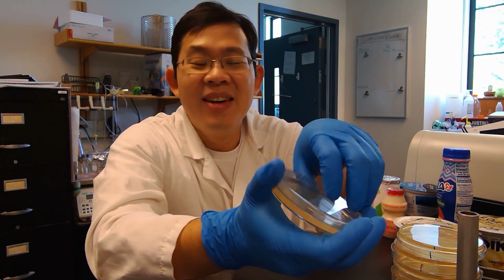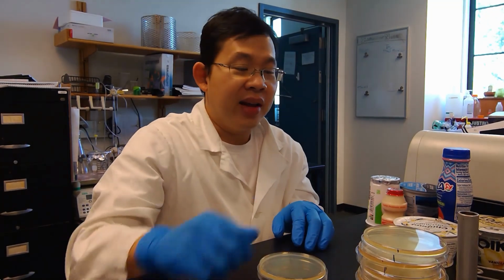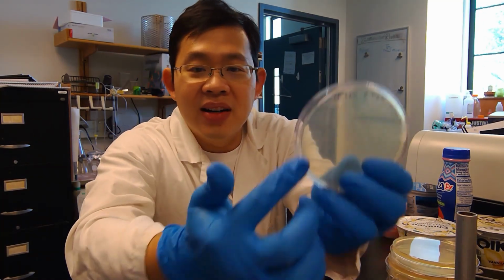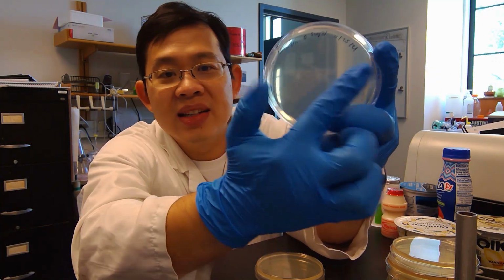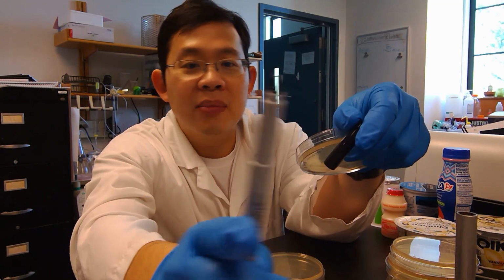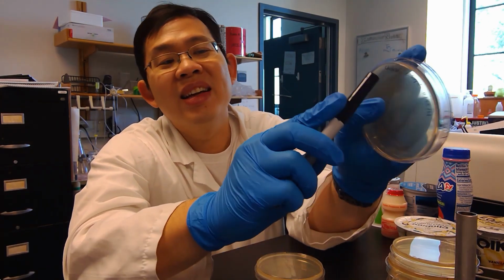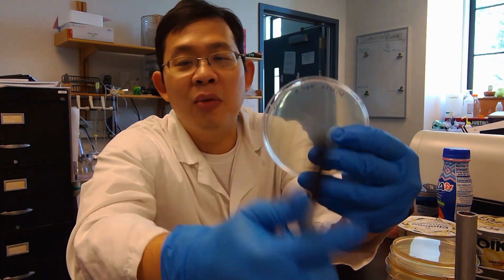So okay, here I have a stack of plates that I already pre-labeled to save time. Generally, when you label the plate, you want to label it on the side like this. See, here's the bottom. Here is the label. You want to label using a fine tip Sharpie, something like this, so that your label doesn't become a big blob. Make it legible, but you don't want to make it too big.